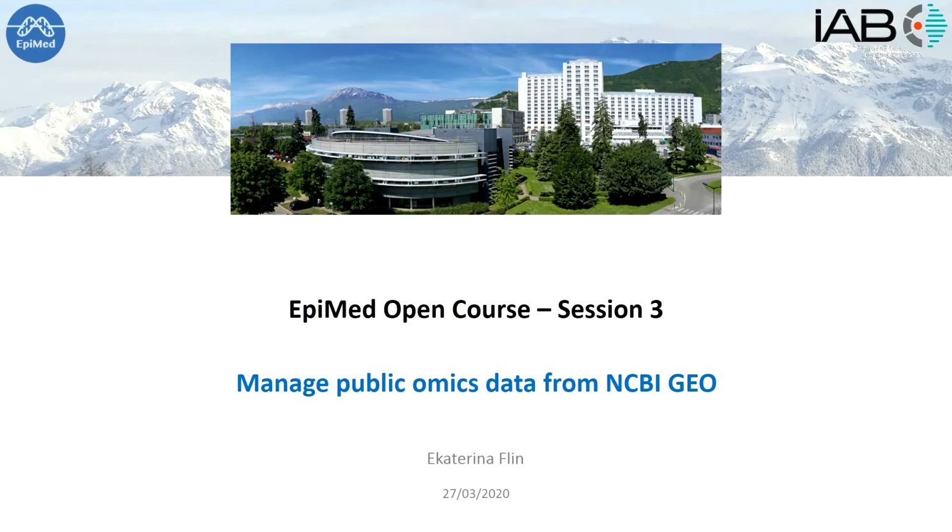We continue our EpiMed course today, and in this episode I would like to show you some tools to manage omics data from well-known public repositories, for example from NCBI GEO, but these tools can also be applied to some other repositories.